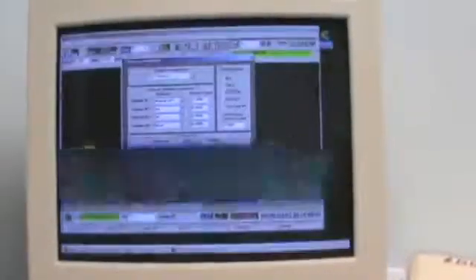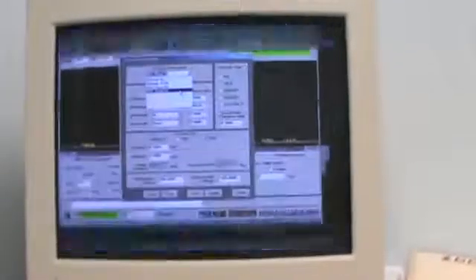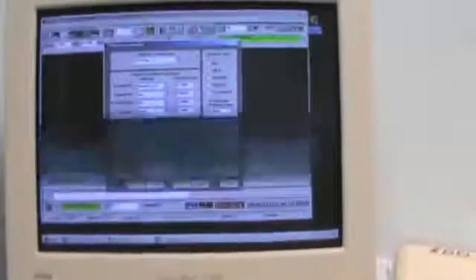Go to the setup menu and look at the detector parameters. Click on edit. Now even for STD you should pick PGT Prism. Windows you can leave as MUSTEC. Polymer window. Now it's important for STD that the bias voltage optimum and maximum should be set at 180. Any higher voltage you can damage the crystal. Click apply. Now you can close.